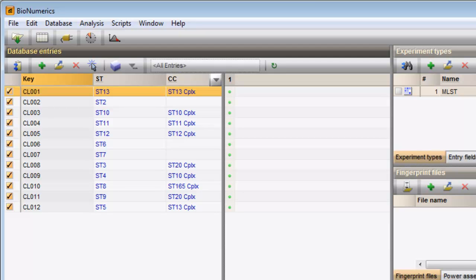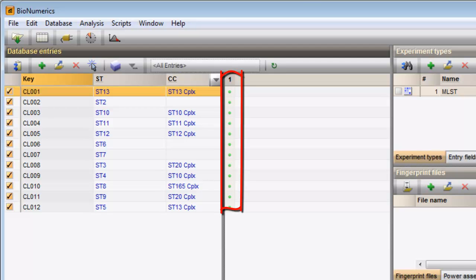For each experiment defined in the database there is a column present in the Experiment Presence panel. This panel is located in the middle panel of the main window. Since in my database only one experiment is present, only one column is present in this panel.